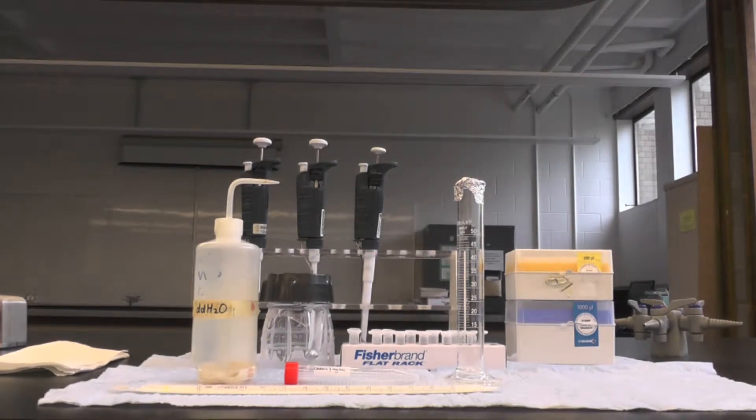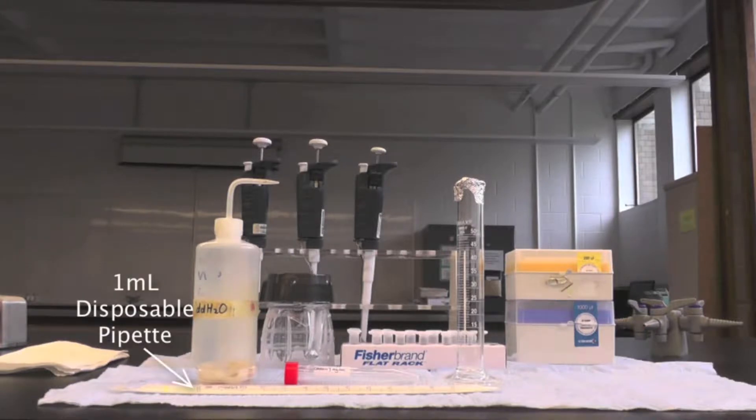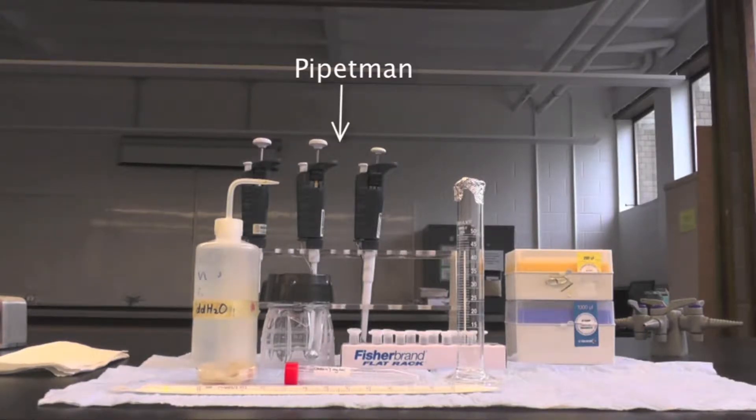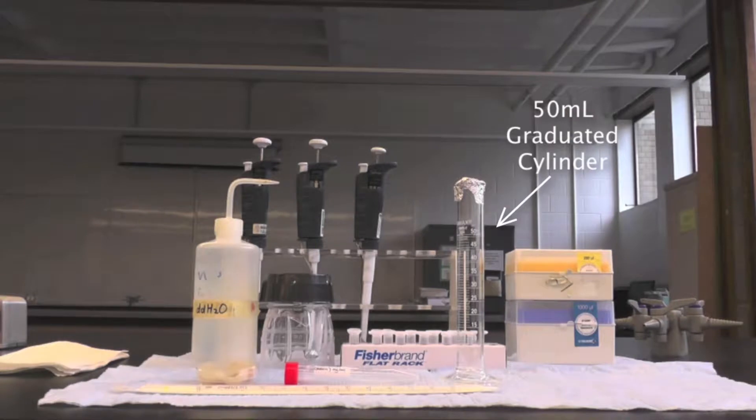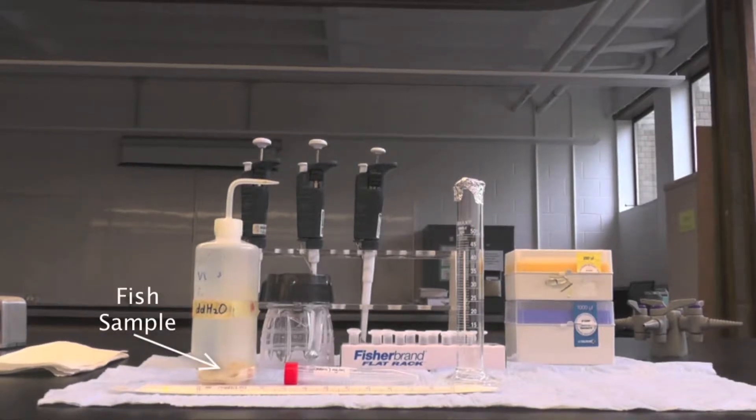The equipment you will need include DD water, blender cup and motor, 1 mL disposable pipette, pipetment pipettes, pipette tips, 15 mL falcon tubes, microfuge tubes, 50 mL graduated cylinder, and your fish sample.